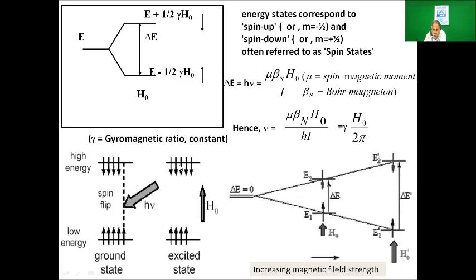So friends, I think now you understand the three parts. The first part is the nuclei, I not equal to 0. The second part is the magnetic field, the external magnetic field H0. And the third one is resonance, that means the difference which we will find in case of the radio frequency when it goes up.